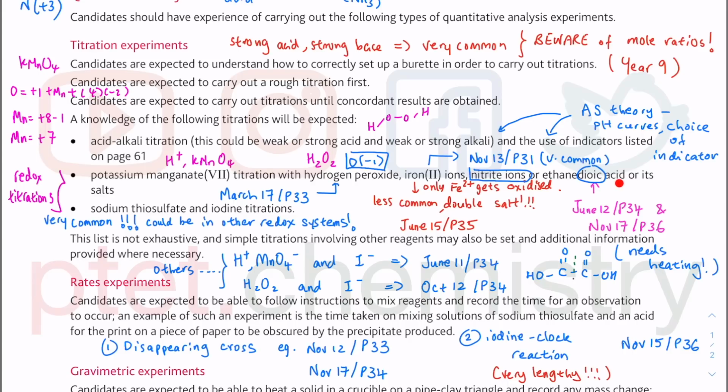Of course, not just the acid, it's salt which contain its ions. So if I remove the H plus, then I will get the ions like that. And I have another H plus, I'll get the ethanedioic ion. This is an ion, a dianion, with a -2 charge. They will also behave similarly and get oxidized by acidified KMnO4, which will turn from purple to colorless, but you stop in a titration when you get a permanent pale pink with 1 extra drop of it.